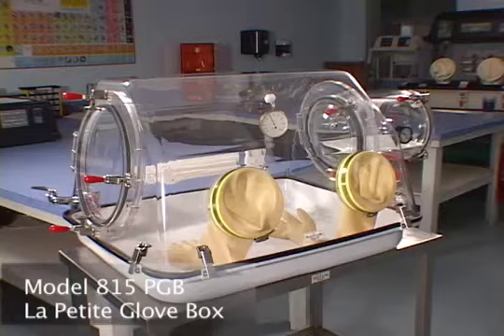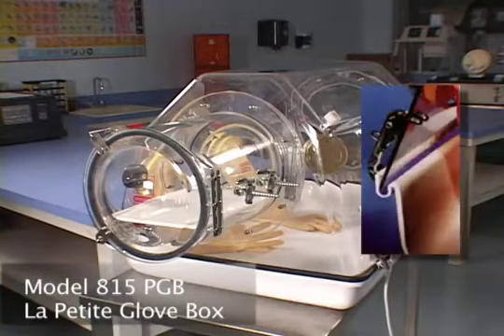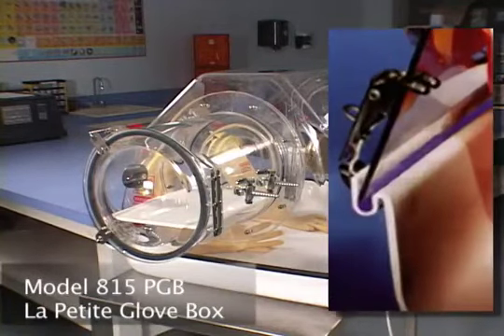The unit is comprised of essentially two components. The top and the bottom are sealed using a revolutionary new gel developed for the clean room industry.